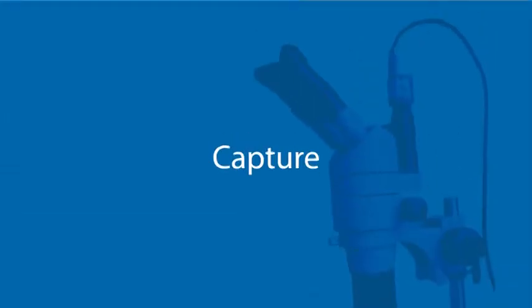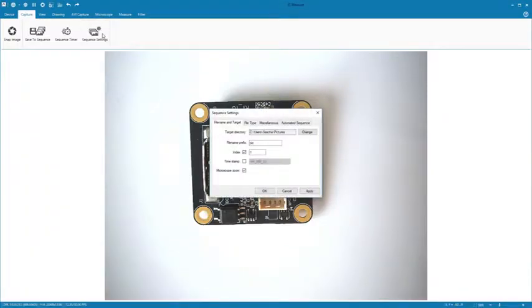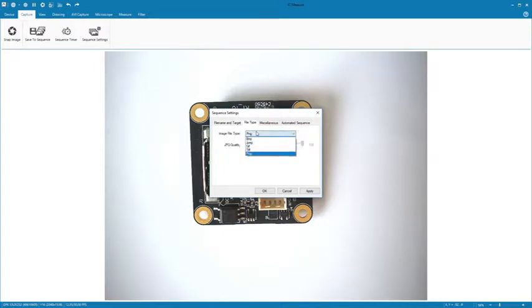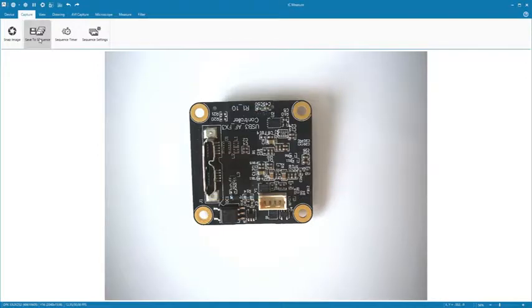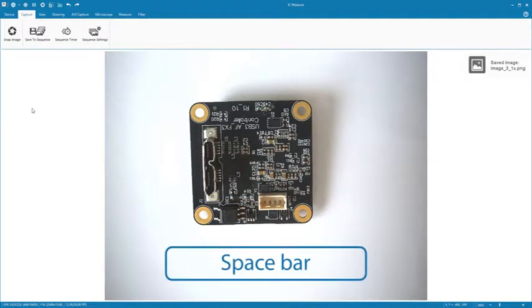Under Capture, you can record single images or image sequences, either manually or automatically. In Sequence Settings, select the filename with prefix and target directory as well as file type. Thereafter, clicking Save to Sequence will add an image.